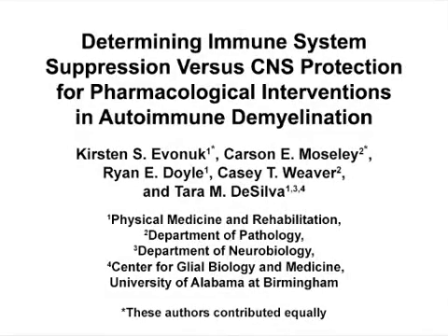The overall goal of this conceptual method is to determine whether pharmacological treatments for experimental autoimmune encephalomyelitis demonstrate their central nervous system protection during the onslaught of immune cell infiltration or as a consequence of immune cell infiltration suppression. This method can help answer key questions in the neuroimmunological field, such as how does manipulating EAE treatment times differentiate the effects on immune cell infiltration versus protection.